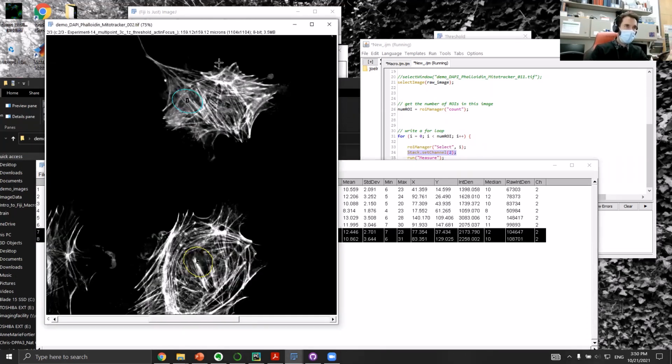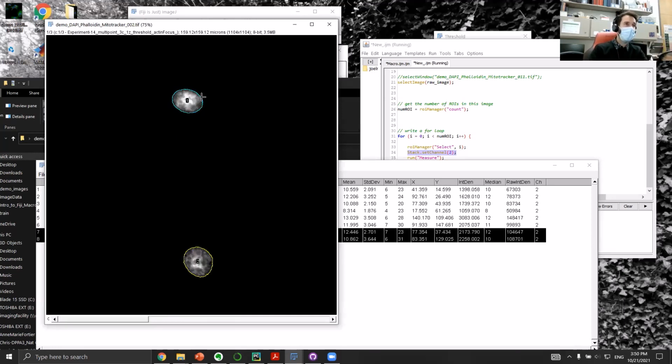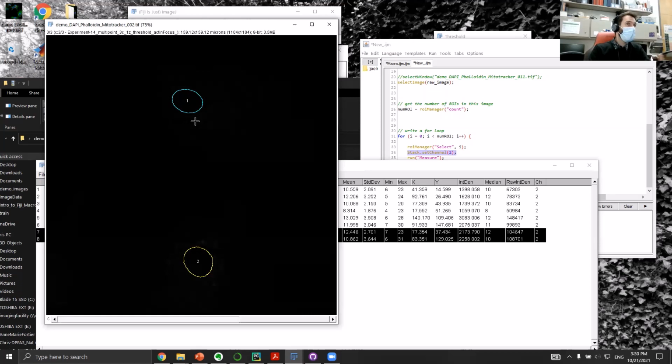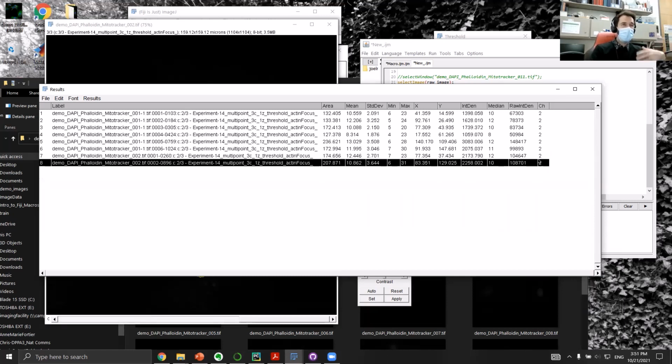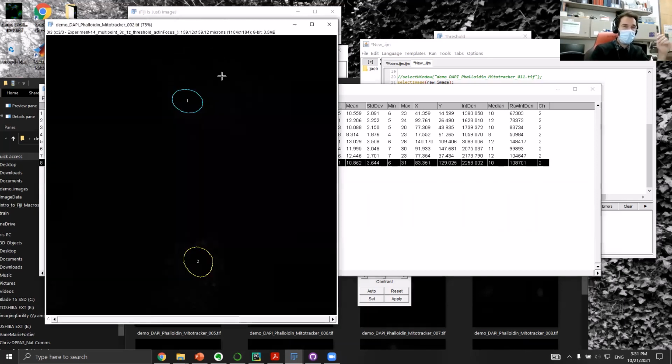If you were to do this manually and you're doing this over and over and over, I can guarantee you that at some point you're going to accidentally measure the wrong channel. And that's a little bit frustrating because you'll get the wrong values. You'll be able hopefully to see it if you have the channel indicated in your results. And so that's what we did in the set measurements. That way you can go back, and if you do see a weird value, then, oh, I accidentally measured, you know, channel 3 or something.